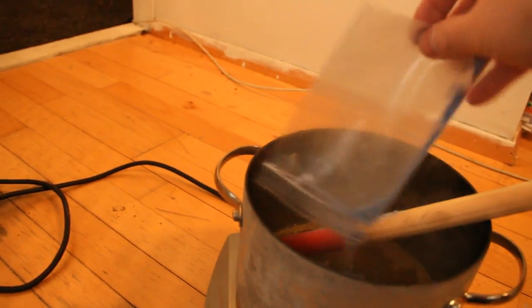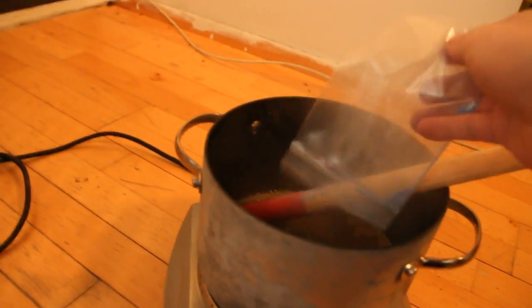It's been pulverized, and we just gotta stir it to incorporate the ground lapis into the mixture. Now we can pour the mixture to let it cool off.